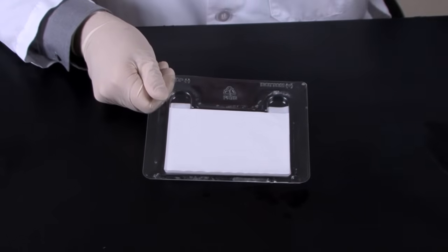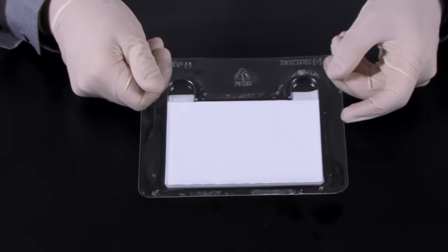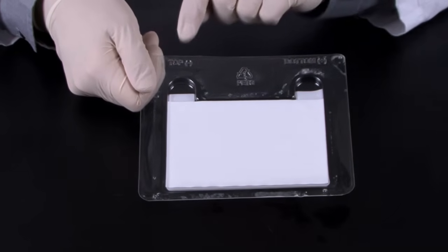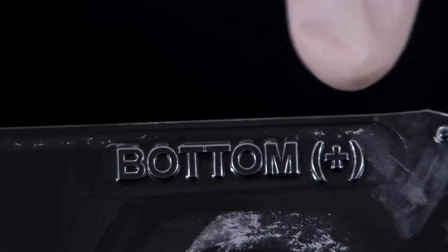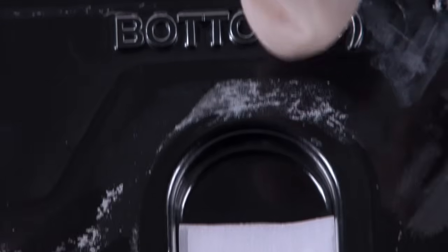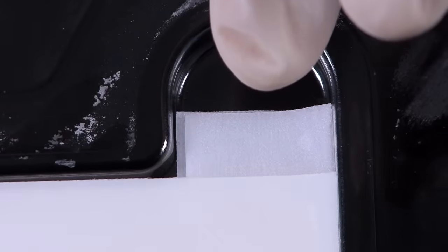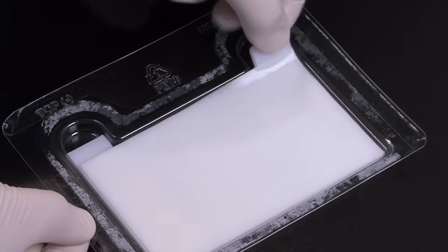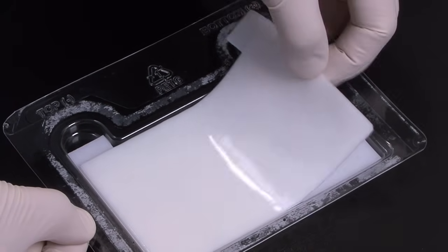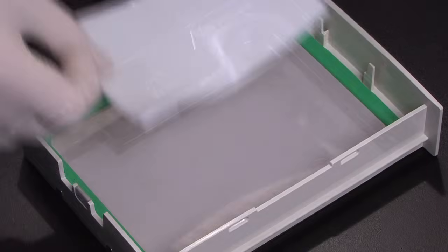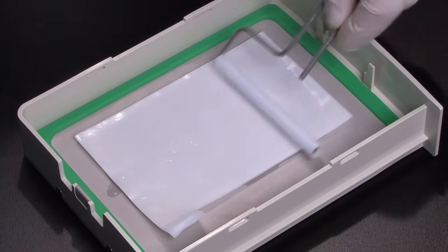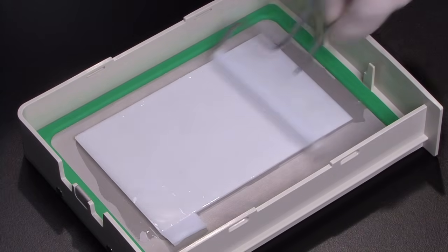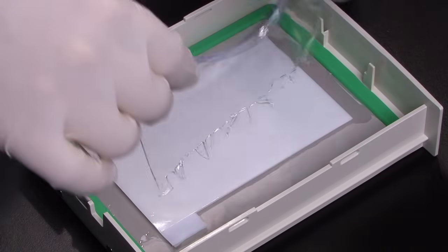Trans-blot turbo transfer packs also come in the larger MIDI size. In the MIDI transfer pack, both the top and bottom ion reservoir stacks are arranged in one tray, one on top of the other, and can easily be separated using the pre-cut tabs on the upper corners. The first or bottom stack, which contains the membrane, is lifted using the right tab and placed in the bottom of the cassette with the membrane facing up. Roll the stack and membrane gently with the blot roller to remove any air trapped between the stack and the cassette.